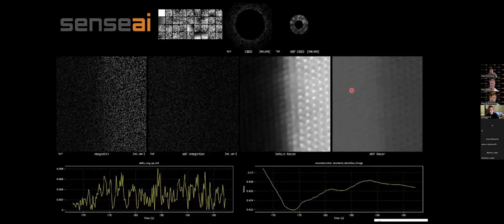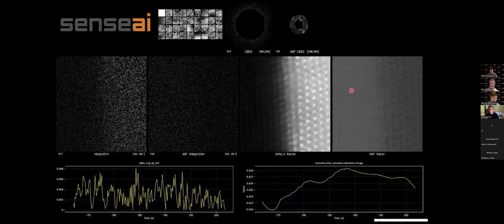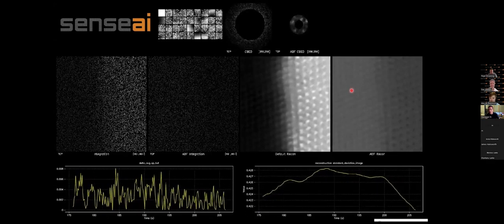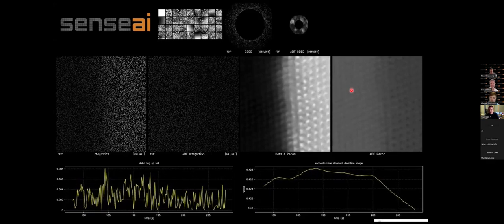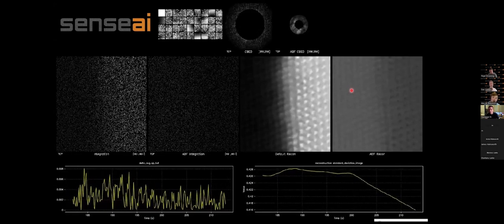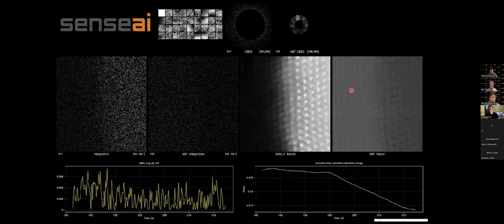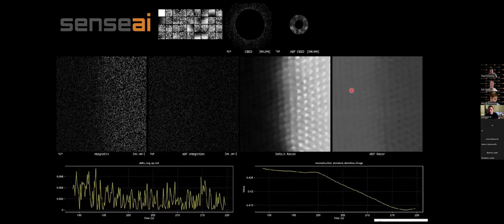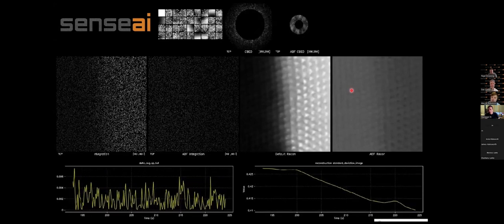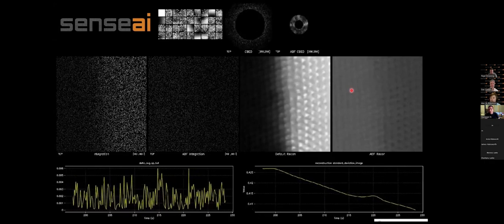Yeah, so this was acquired at 20% or 10%. We did two kinds of experiments, remember? Yes, this one's the 10% acquisition. Okay. And what we did was we adjusted our emission current and kept the same sampling rate, and then also increased the sampling rate with the same emission current, and found that it took longer for the grain boundary to degrade as a direct result of sampling fewer points.